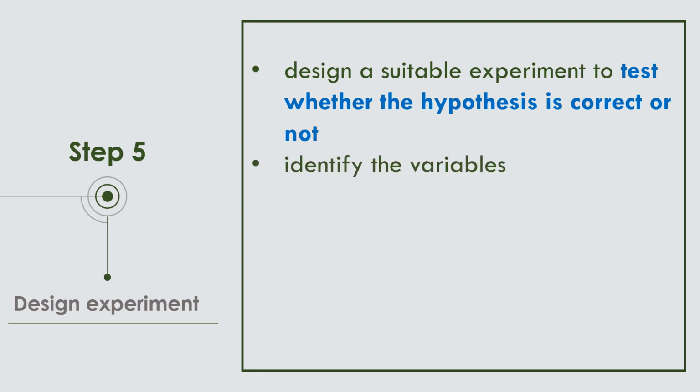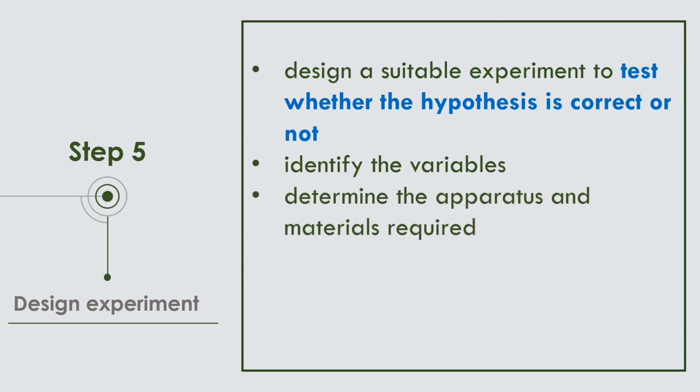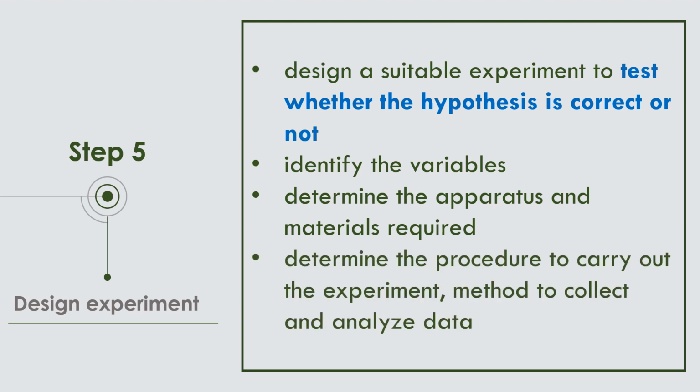And you need to identify the variables, such as independent variable and dependent variable, and then determine the apparatus and what materials are required. Moreover, you need to determine the procedure of the experiment to collect and analyze data.